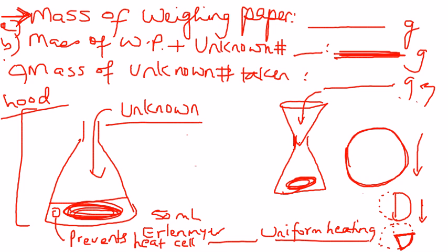And basically use one of the edges, much the same way you did that in Gen Chem 1 or Gen Chem 2, so it looks like a cone, like a birthday hat. And you're going to put that into your funnel. So let me just switch the color to show you how that would look.